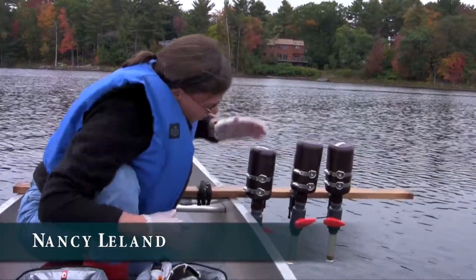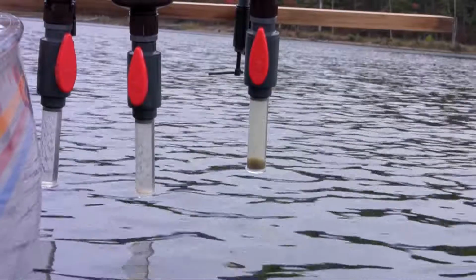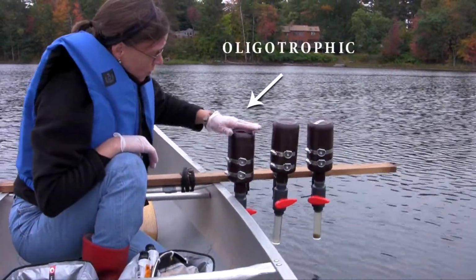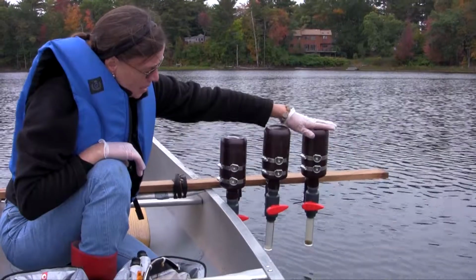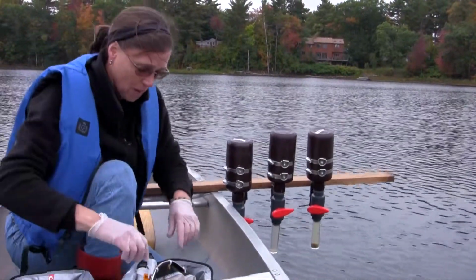You can see there's different amounts of the zooplankton sample, zooplankton biomass in each one of these containers. This is the oligotrophic system here. This is Willen Pond. This is Lake Cochituick, which is a mesotrophic system. And this is Lake Attitash, which is a highly eutrophic system. And you can see there's different amounts in each one.